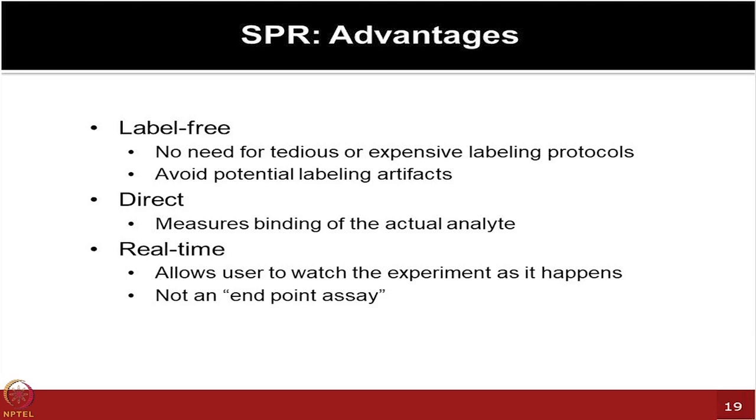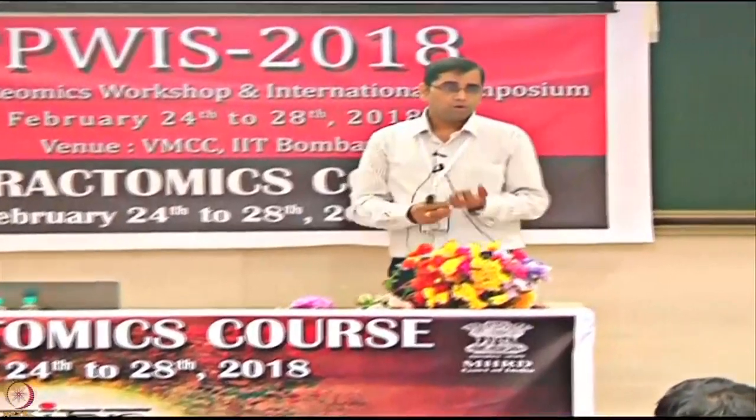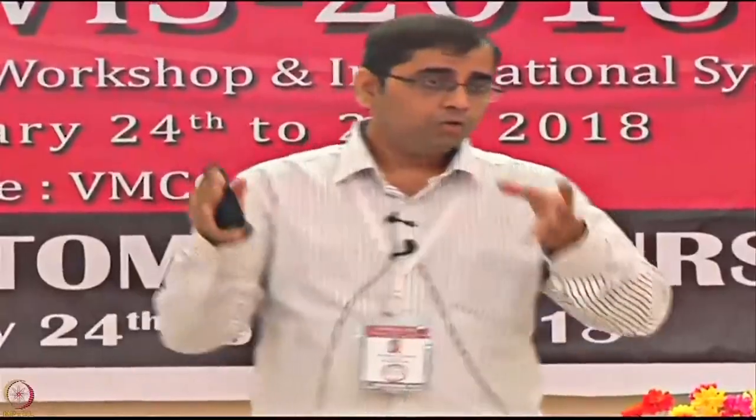Many times we try out different concentrations of different antibodies when we are doing the first initial screening, or you can use different flow rates to try out. So many things you can play with in the initial round of experiments to find out the best condition for your binding to be observed. Once you finalize those conditions, you can apply the same on your full experiment with many of the molecules of interest.